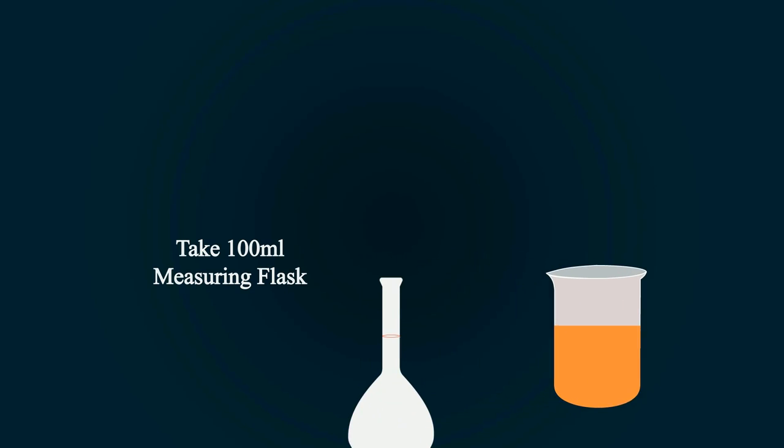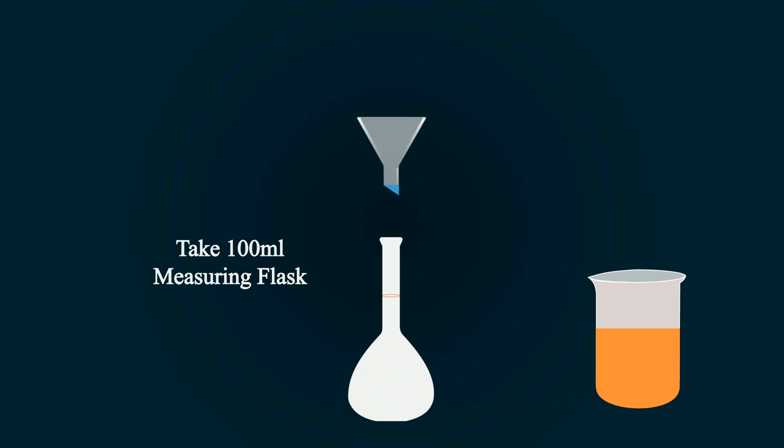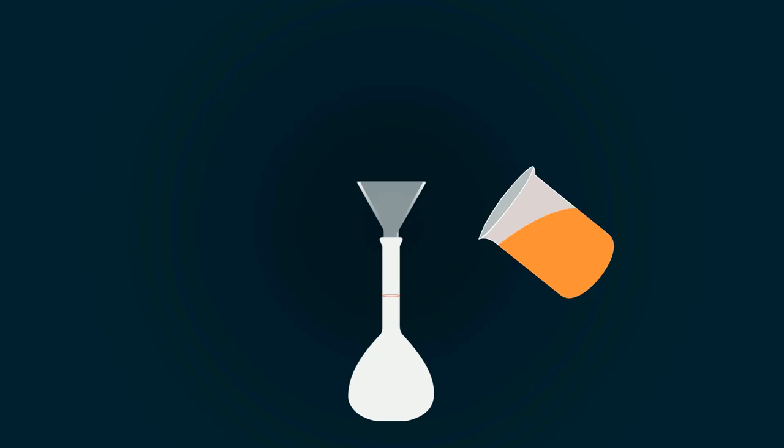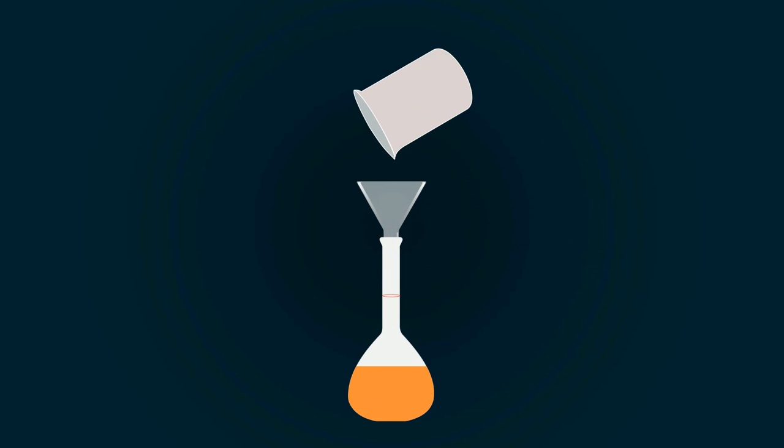Now take a measuring flask of 100 milliliters and put a funnel on the top of the flask. Start pouring all the solution into the volumetric flask.